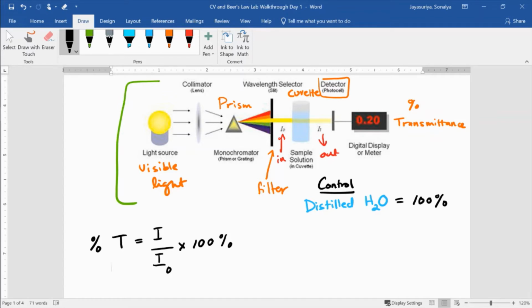If you have something like different solutes inside your solution of different concentrations, the greater the concentration, meaning deeper the color, the less light would be transmitted because more light would be absorbed, okay? More particles or more moles in the solution means that more light will be absorbed by those particles and less light will be transmitted, okay? So this is often called the reference blank.